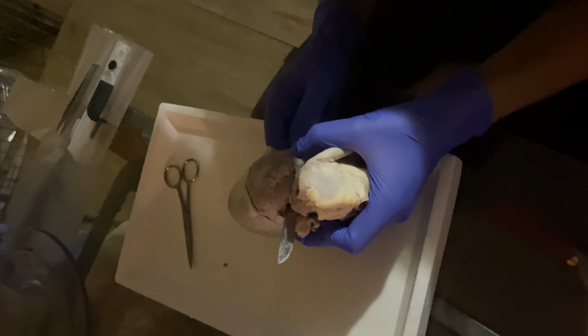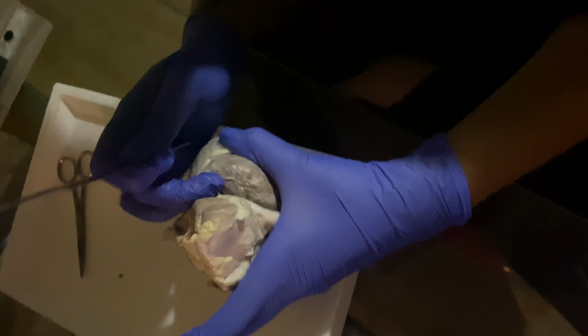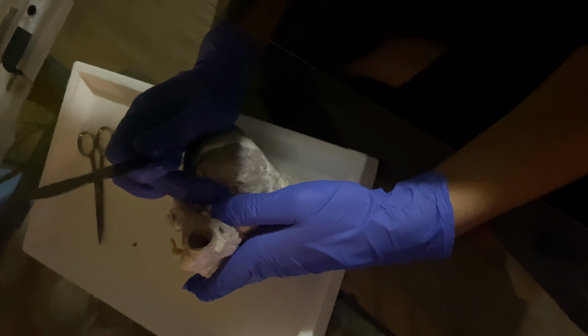And so then, blood will flow from here to here, and it'll go up and across. You take the probe and you stick it like this. It will come out of the pulmonary trunk. So here's the pulmonary trunk. The probe is actually going through the pulmonary valve, which you see here. Right up in there. It's small, so it's much harder to see than these very large atrioventricular valves.